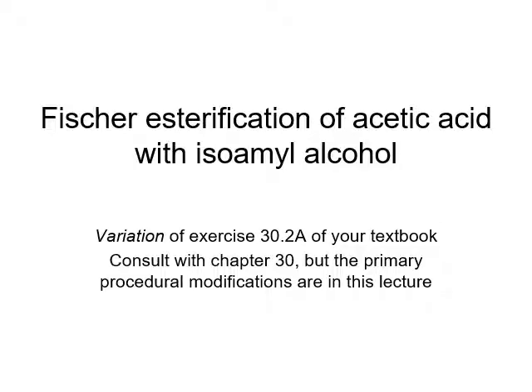Today I will be talking about the Fischer esterification of acetic acid with isoamyl alcohol. This is a variation of exercise 30.2a from your textbook. You should consult with chapter 30, but the primary procedural modifications are in this lecture.